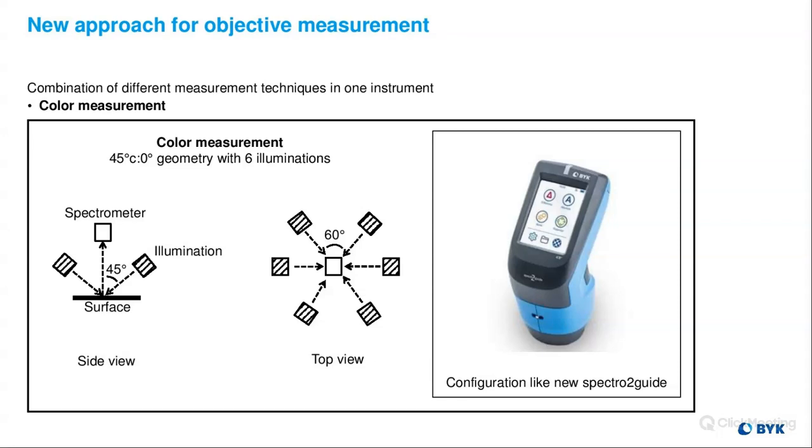So you have your 6 different LEDs, which give you that circumferential illumination. So light's coming from all directions rather than one direction. If light came from one direction and you took a measurement in a different orientation than your last measurement, you would get different results. When it comes from all directions, no matter how you orientate it, you're always going to get the same value.